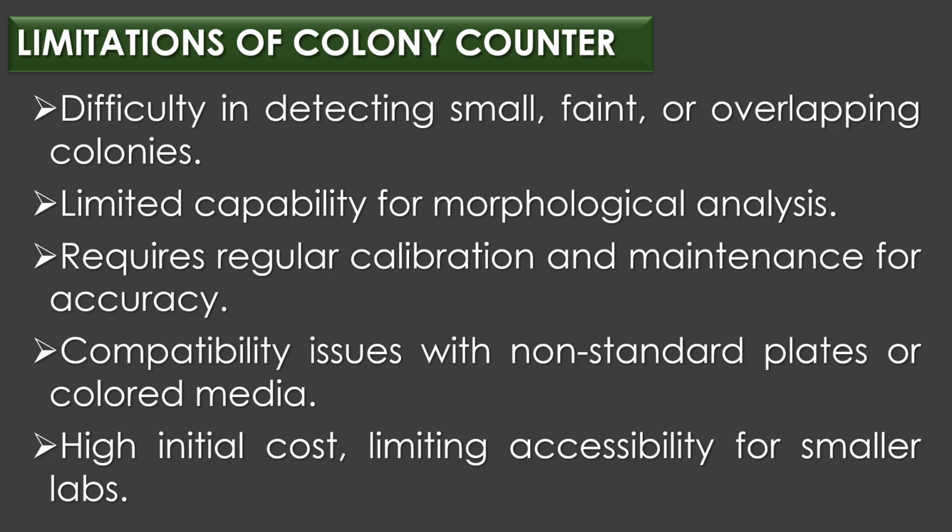Limitations of colony counter. The limitations of colony counter include difficulty in detecting small, faint or overlapping colonies, limited capability for morphological analysis, requires regular calibration and maintenance for accuracy, compatibility issues with non-standard plates or colored media, high initial cost and limiting accessibility for small labs.